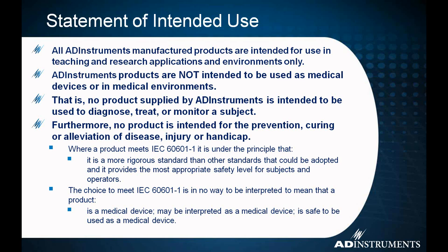And like I said, we're going to cover some things that customers have asked us about. What can we use your equipment for? What can we use the software for? Out of all this verbiage that's up here on the screen, the thing to take away is that the PowerLab and our associated products are not intended to be used as medical devices or in medical environments. Can they be used in a medical research environment? Yes, but they cannot be used to diagnose or treat a disease, an injury, anything in a patient. They're designed purely for research. They are not for clinical use. So that's the take-home message from all this that's up here on the screen.